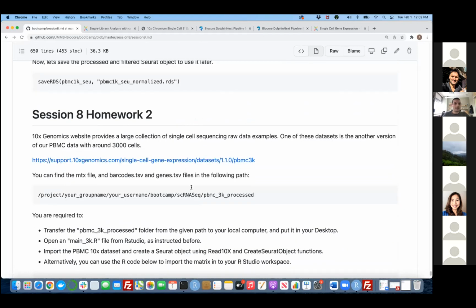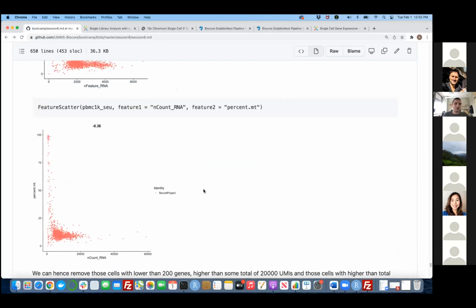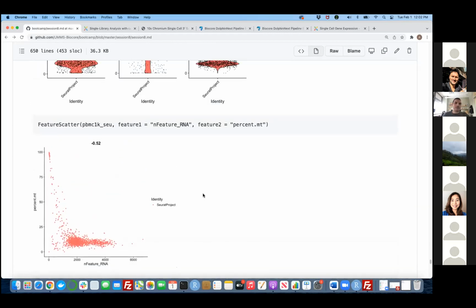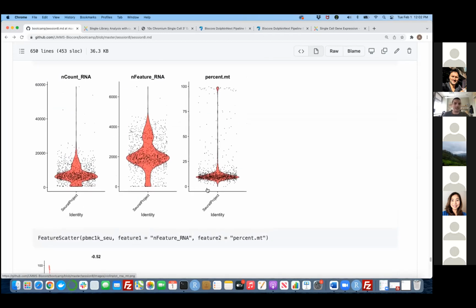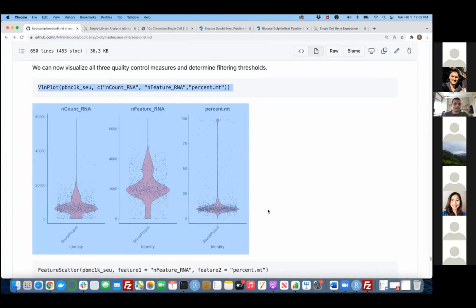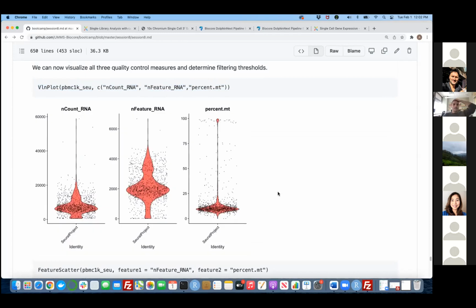I have a quick question about the mitochondrial counts. Is that the DNA, mitochondrial DNA, or mitochondrial RNA? Oh, okay. I might be using the wrong terms. They are mitochondrial DNA because at the end of the day we will have complementary DNA that we align to the genome, so we're just capturing those. Excuse me when I said RNA, I meant mtDNA. No, but how can they be DNA? Because we are doing RNA isolation. So these are coming from mitochondrial RNAs.